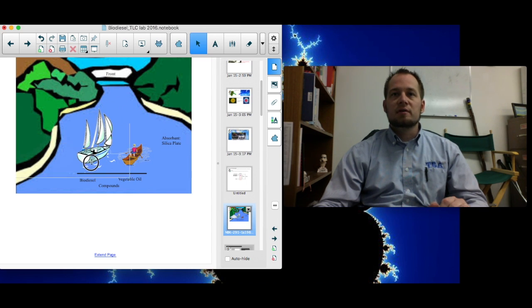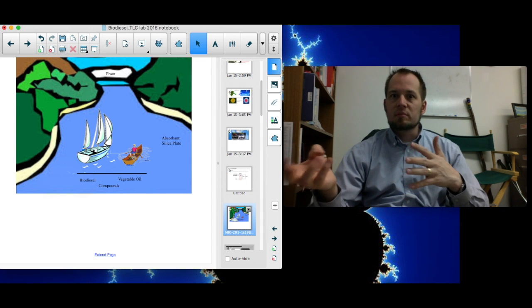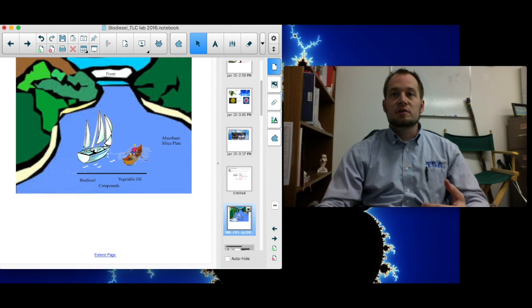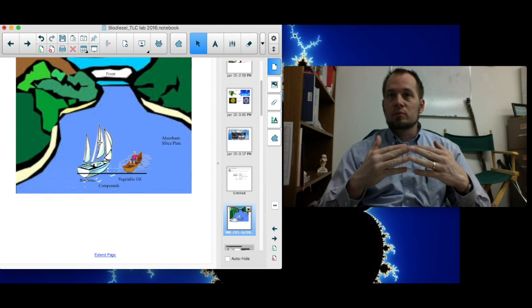In this case, we have biodiesel, and we're going to compare it to the vegetable oil. So you oftentimes want to compare it to a known substance or the starting substance and make sure that you actually got a chemical reaction to make something new. Okay, so in this case, we put the vegetable oil down here, and we put the biodiesel boat also down there. So they both have the same starting point.